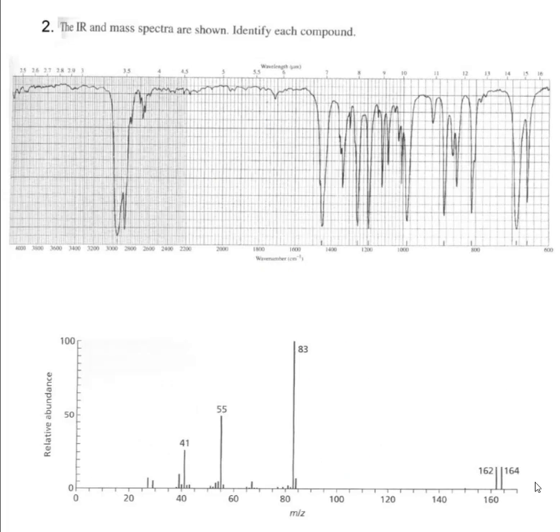Okay, question number 2, we've got the IR, which really, what this is telling me is nothing. There's nothing that really stands out here. No reading that we care about. There's no OH, right? There's no OH. There's no carbonyl. There's no alkene. There's no alkyne. Nothing. There's really not much given. So it's completely empty in the areas that matter. So there's nothing provided here.